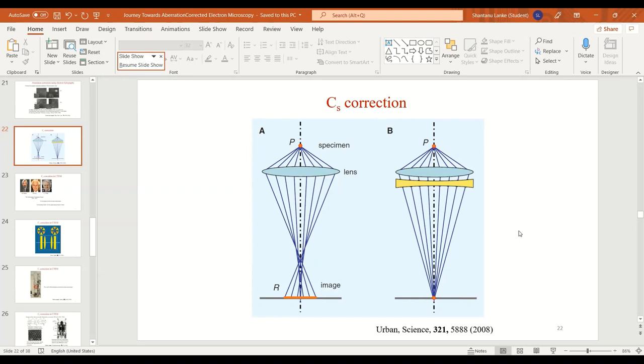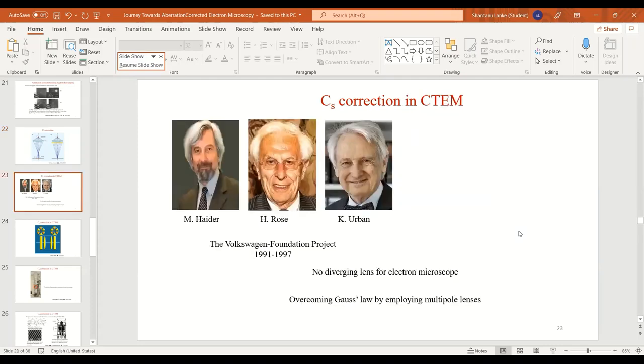And you have some aberrations called parasitic aberrations, which are very difficult to control. Ideally you should have no temperature gradient between the column and the room, no flowing winds, no electromagnetic fields, and you should not speak.